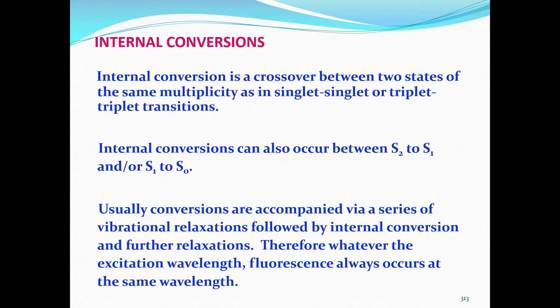Another phenomenon that you should understand is internal conversion. Internal conversion is a crossover between two states of the same multiplicity, as in one singlet state to another singlet state transition, or a triplet transition is also possible. So, these can also occur between S2 to S1 or S1 to S0.